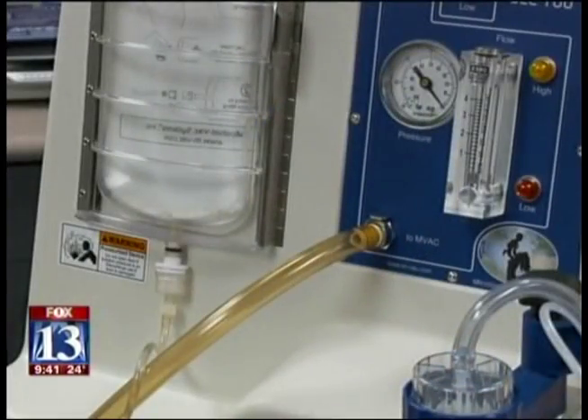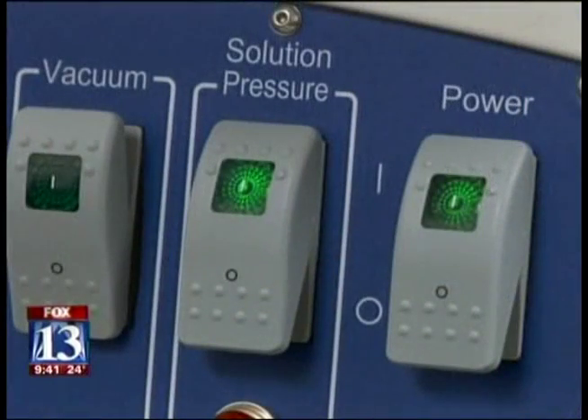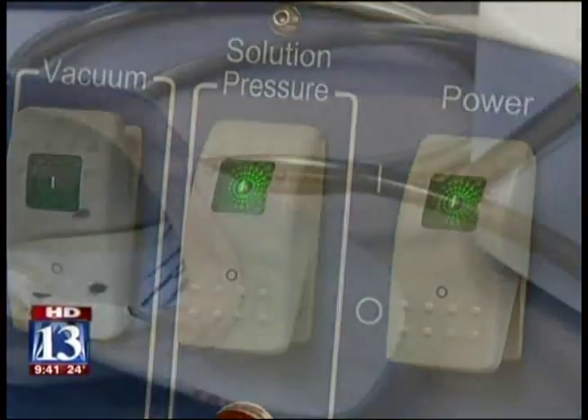The key, especially for the MVAC, is if those cells are spread over a larger surface area, or they're in a fabric or a porous material that makes it more difficult to extract or collect — that's when the MVAC is really going to excel.